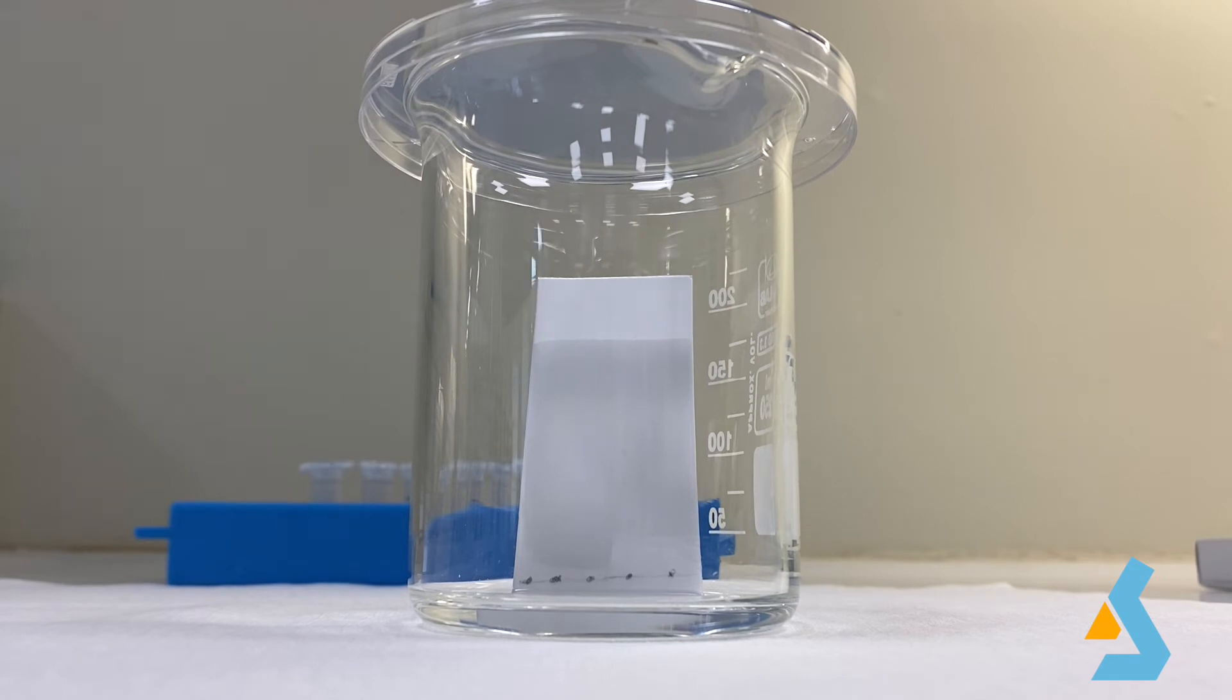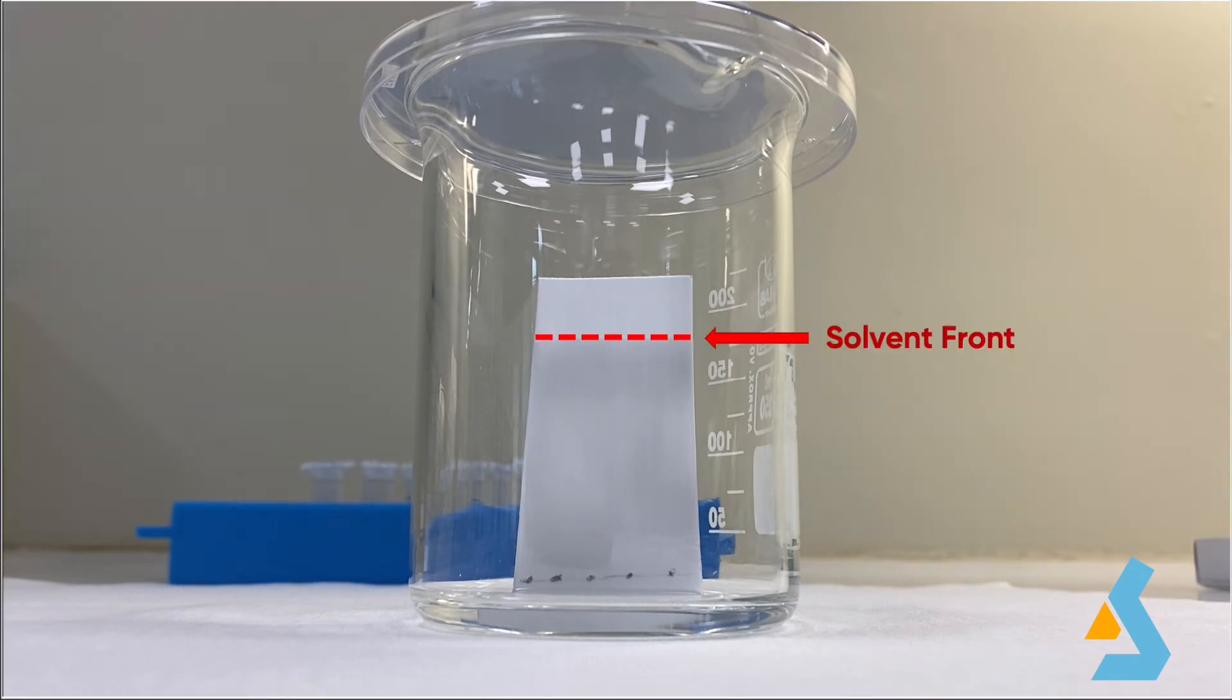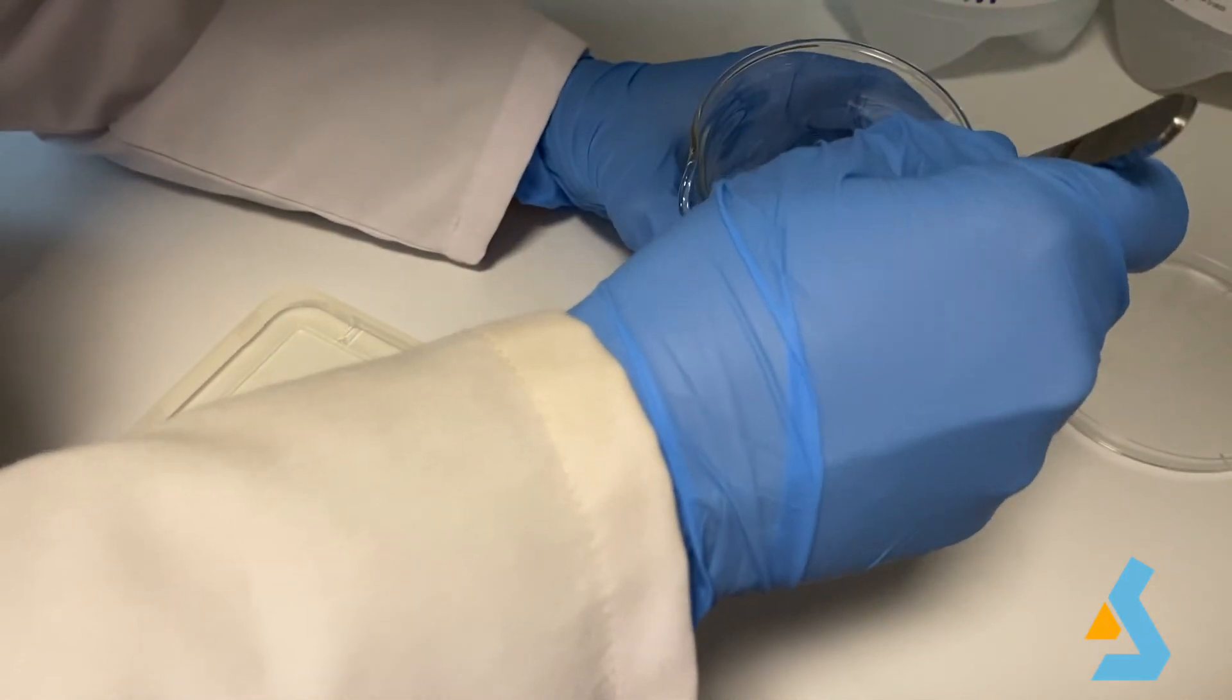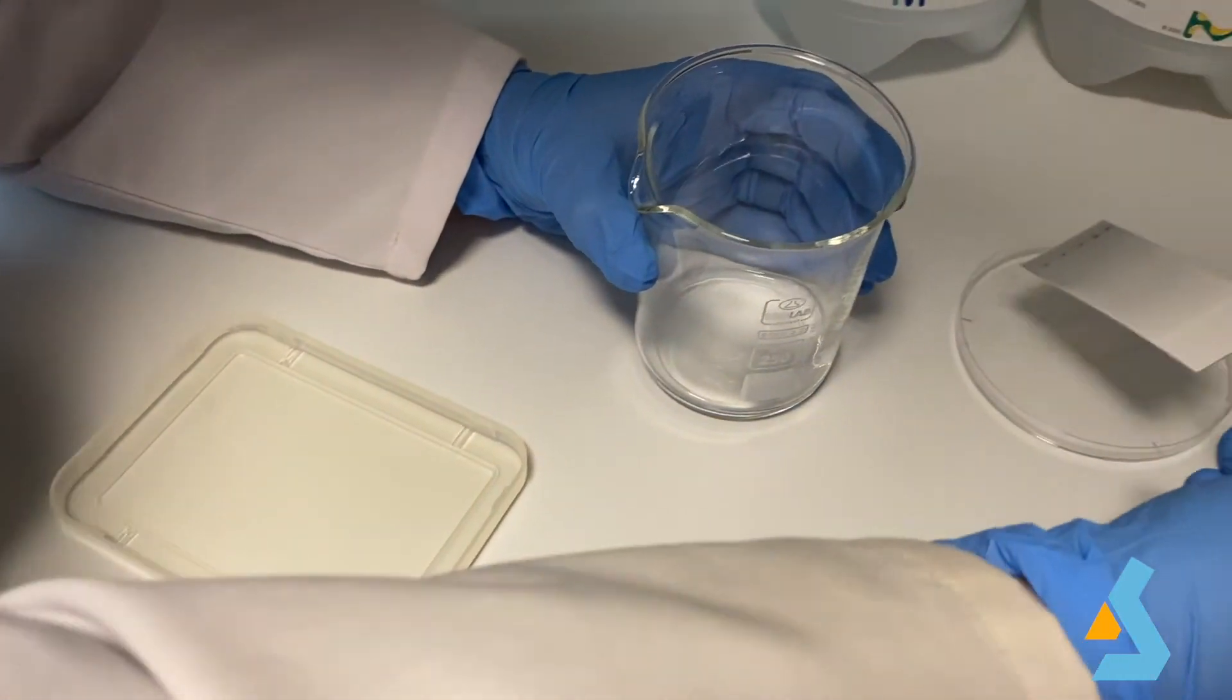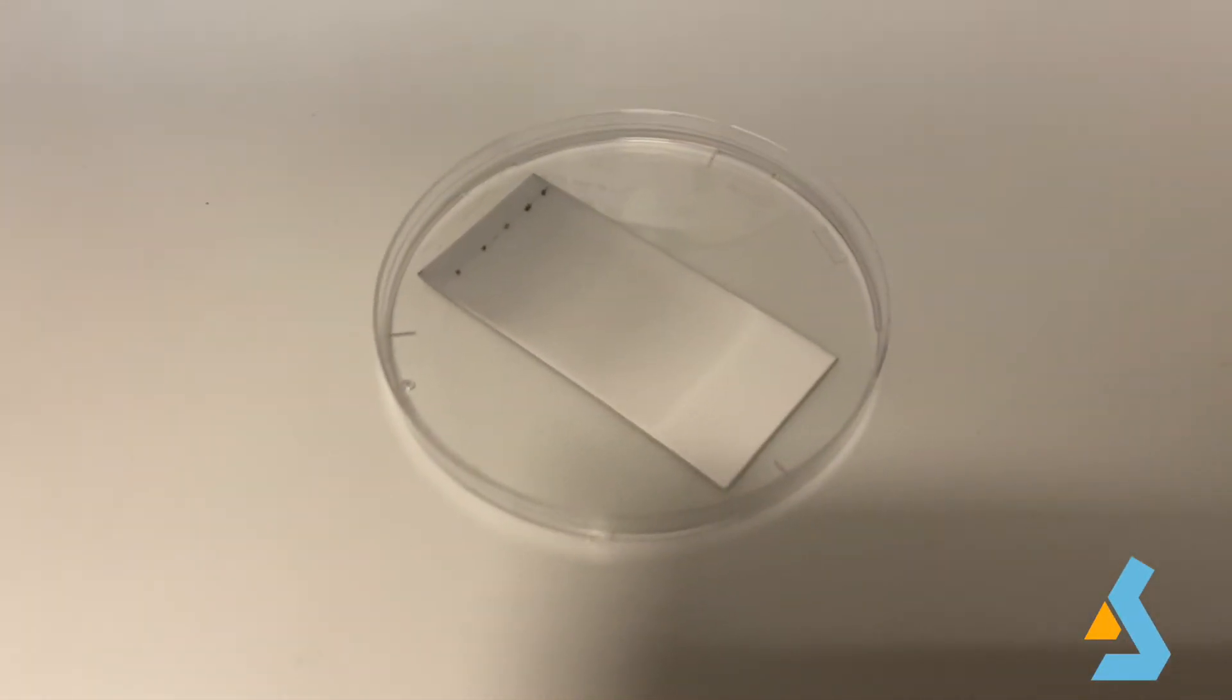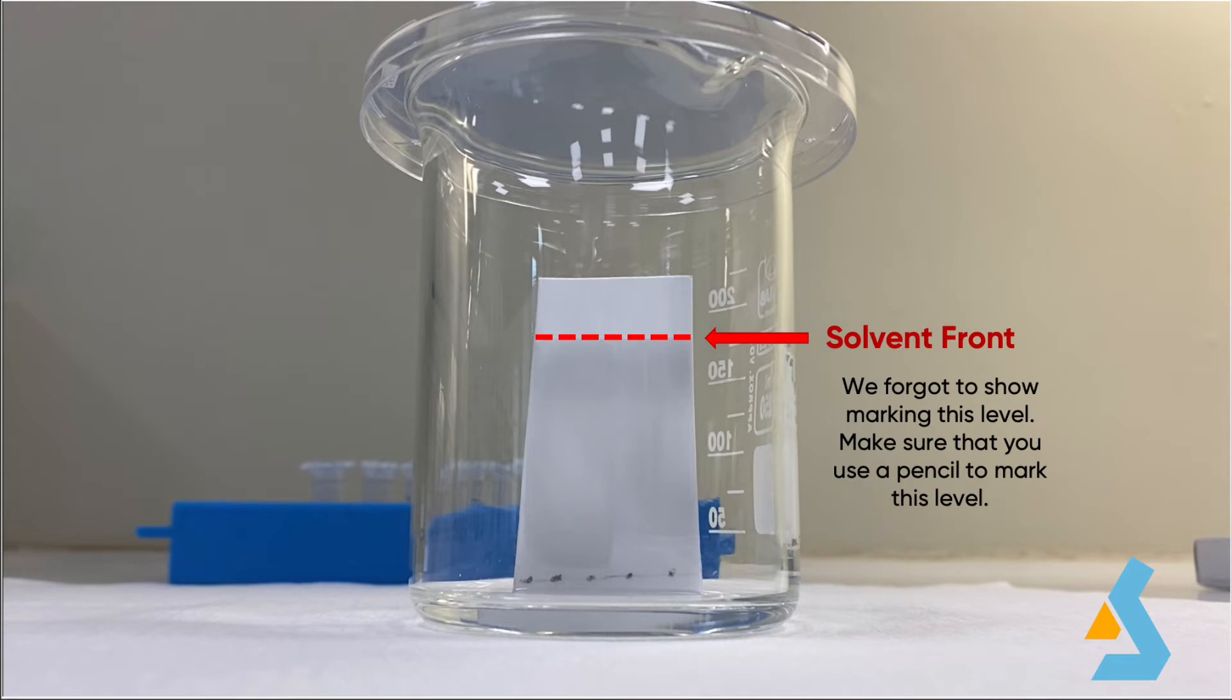It took around an hour for the solvent front to be completed. Now that the solvent front formed, we take the TLC plate out and leave it to dry. It's important to mark the solvent front level while it is still apparent. Make sure to mark with a pencil.